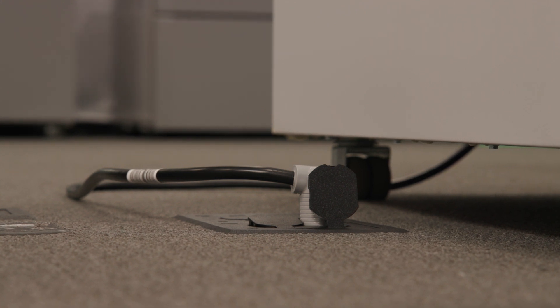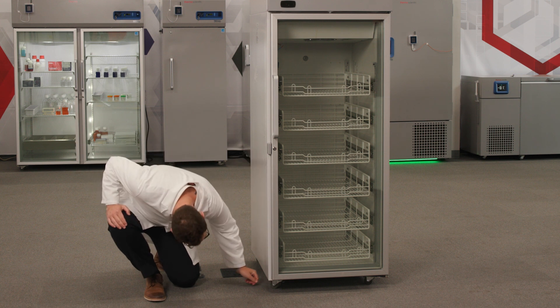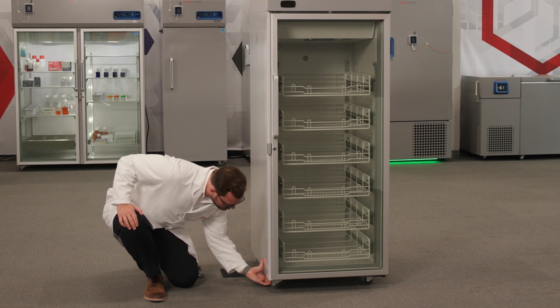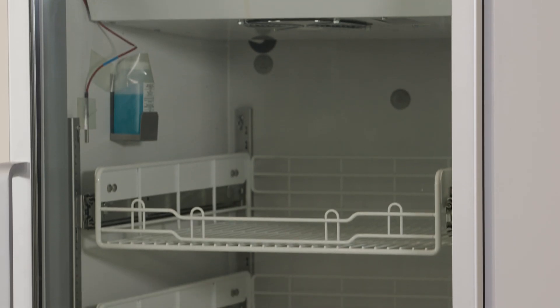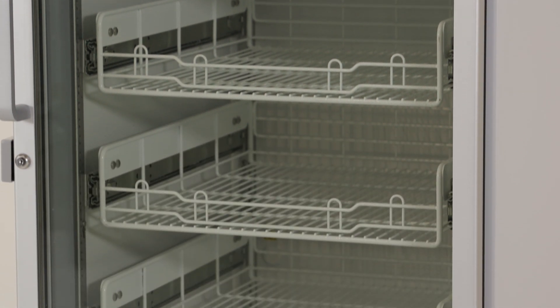Do not use extension cords to power this refrigerator. Lock the caster brakes when the refrigerator is in its final location. Make sure the cabinet is level front to rear and side to side. Before powering on the refrigerator, make sure that all of the packing wood and cardboard have been removed.